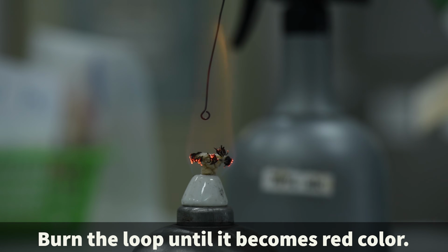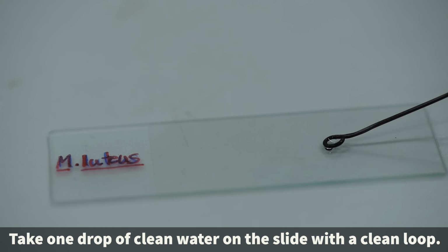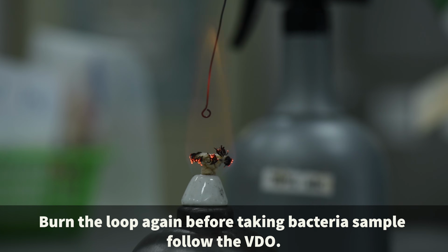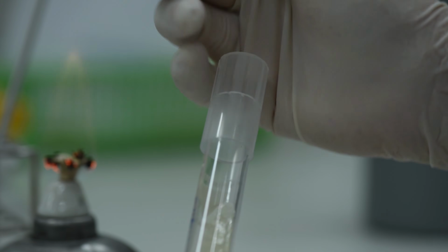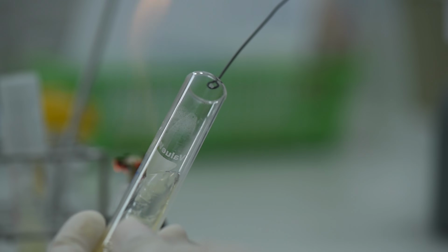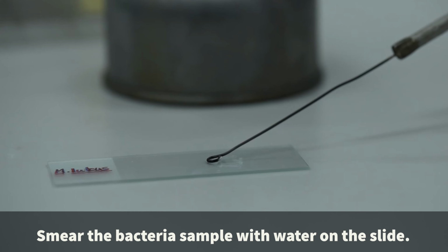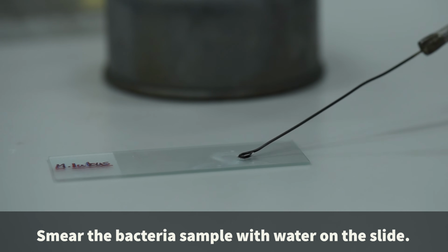Burn the loop until it becomes red color. Take 1 drop of clean water on the slide with a clean loop. Burn the loop again before taking bacterial sample. Follow the video. Smear the bacterial sample with water on the slide.